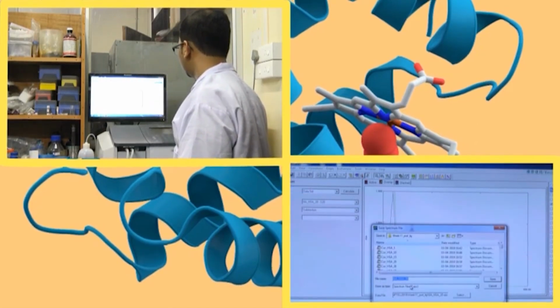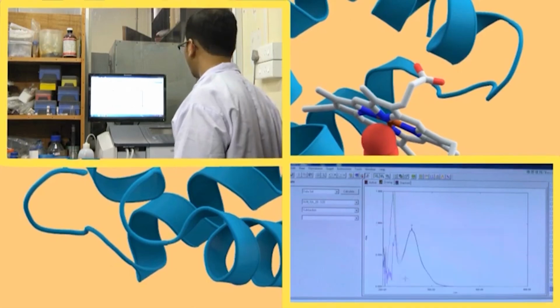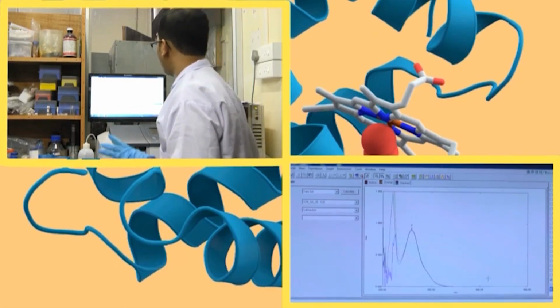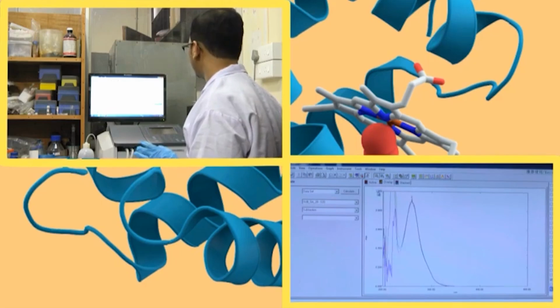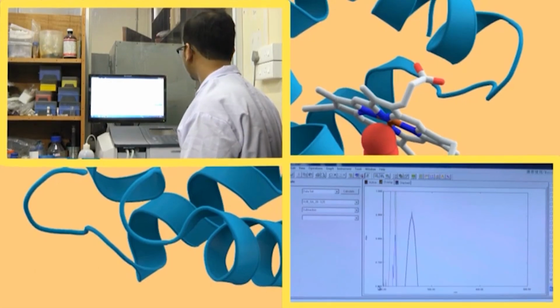Save as SUB GA 20 text file. Okay. So, now what I am observing here is that if we just highlight this and zoom this point. So, let us suppose 1.0 and the lower part let us enhance to around 0.6.